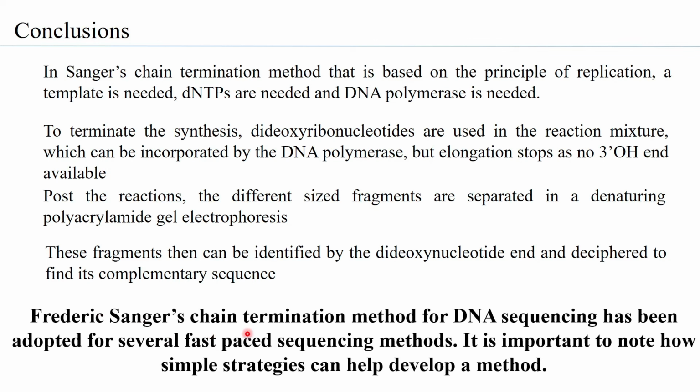Therefore, Frederick Sanger's chain termination method for DNA sequencing has been adopted for several fast-paced sequencing methods today. It is important to note how simple strategies can help develop a very important method.